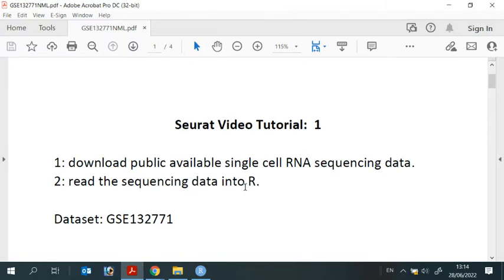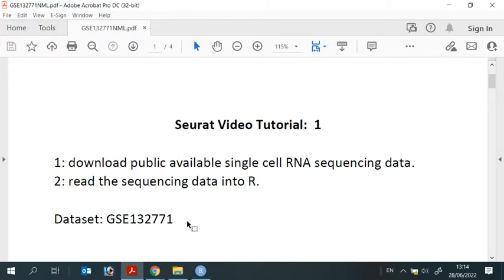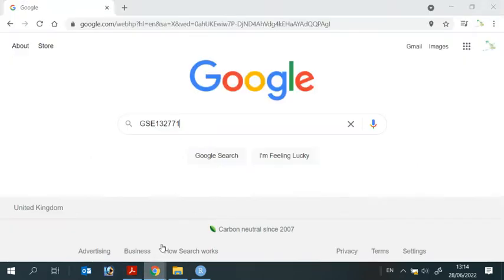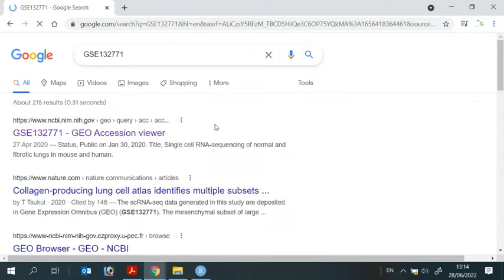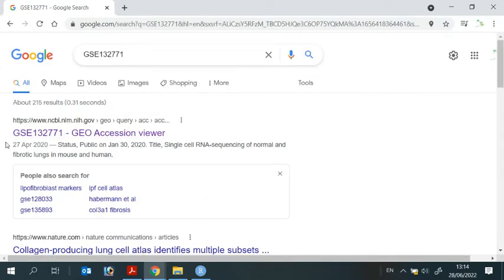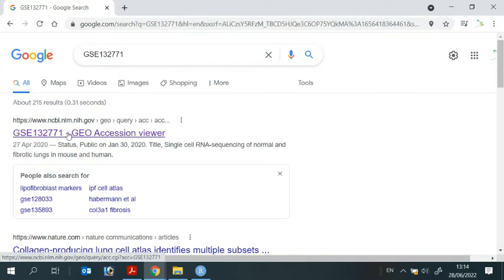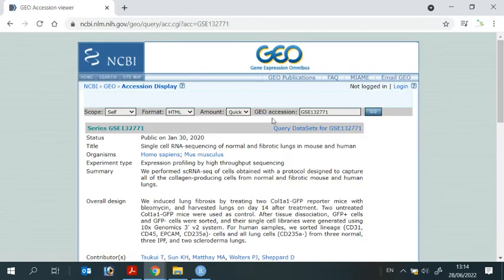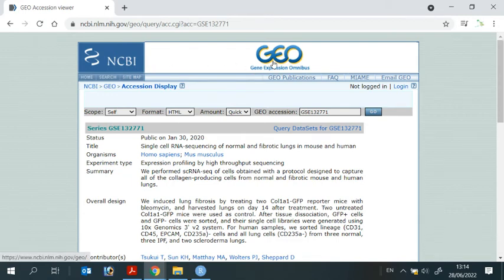The data set that I'm using today for the demonstration is GSE 132771. So we can go to Google and search the data set. The first link is the data that we wanted. We can press the link and it will take us to NCBI GEO website.